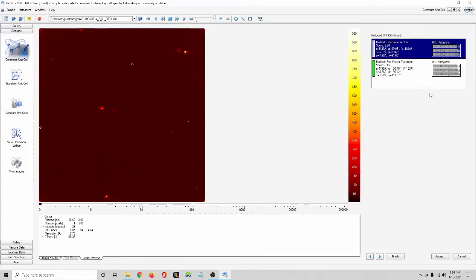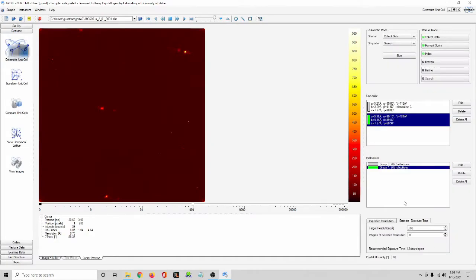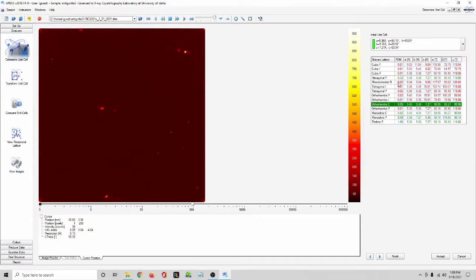Okay, that looks good. Accept, refine, accept, bravi. Okay, so now it comes up with more solutions.